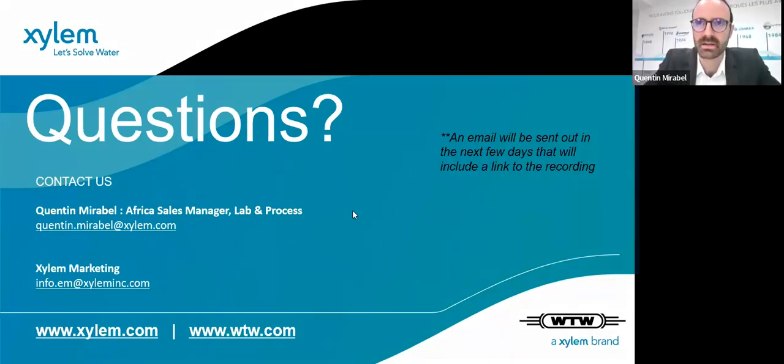If I may add a comment on that, Georg, we do have ATEX sensors and transmitters, but not for spectral sensors. We can measure pH and conductivity in ATEX areas. So not for the parameters we are talking about today, but for pH and conductivity, yes, it's possible. WTW offers this, but only for pH and conductivity.